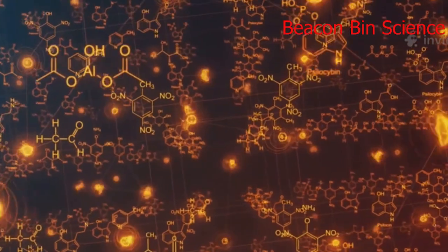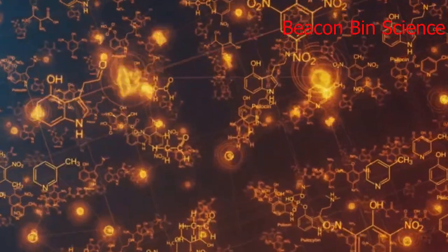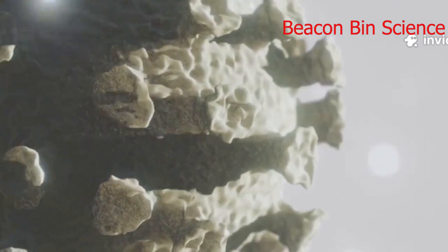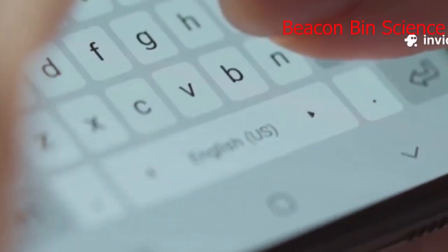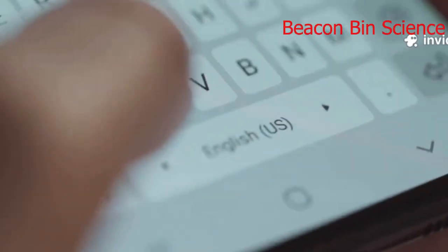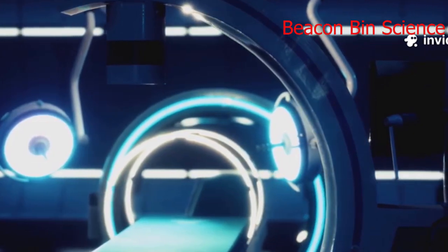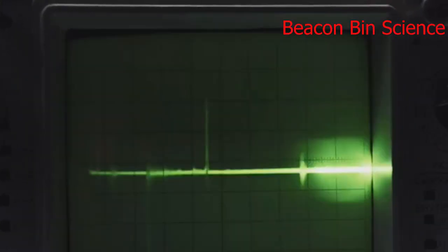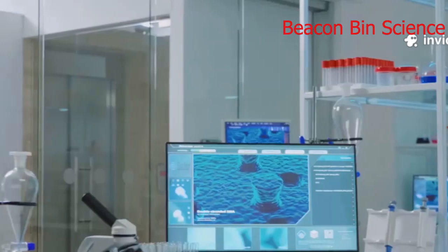So why is NMR so important? Because unlike other techniques, NMR doesn't just tell you the formula, it tells you the exact arrangement of atoms. It's like having X-ray vision into the molecule. That's why NMR is a central tool in organic chemistry, the pharmaceutical industry, and even in biology for studying proteins and DNA.